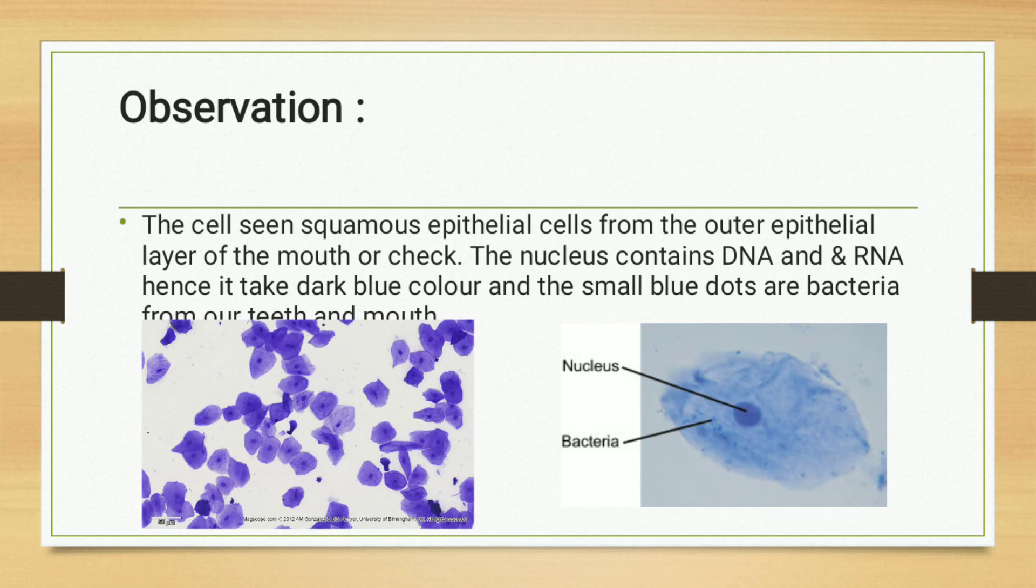These cells contain DNA and RNA, hence they take a dark blue color. These small spots or dots that are present in the cell are bacteria from our teeth and mouth. This is the observation done under microscope. Easily we can see the buccal epithelial cells.